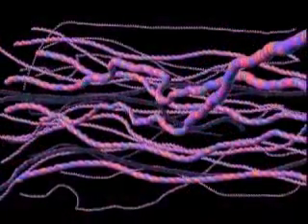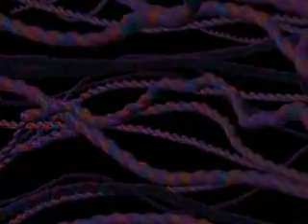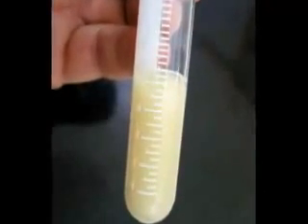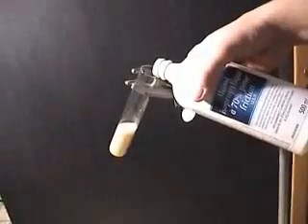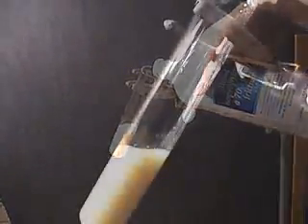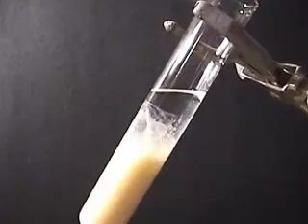The strands of DNA are now exposed but they are mixed thoroughly into the solution. We will take advantage of differences in density and solubility to separate the DNA from this mixture. Gently transfer some of this solution into a test tube. Isopropyl alcohol — rubbing alcohol — is less dense than water and it does not dissolve DNA. Carefully adding isopropyl alcohol to the solution causes the DNA to separate out, floating as a clear membrane into the pool of alcohol suspended on top.